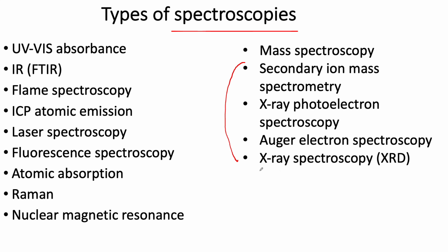And then there's, this one's different, X-ray diffraction. Right, this is used for single crystals. This is how, remember you heard about these fellows, Watson and Crick determined the structure of DNA. Well, DNA, when they were looking at it, was in a crystal. Right? So the DNA had been crystallized. It was in solution, you dried it out very carefully, and you can do this with a salt crystal or any other kind of crystal.